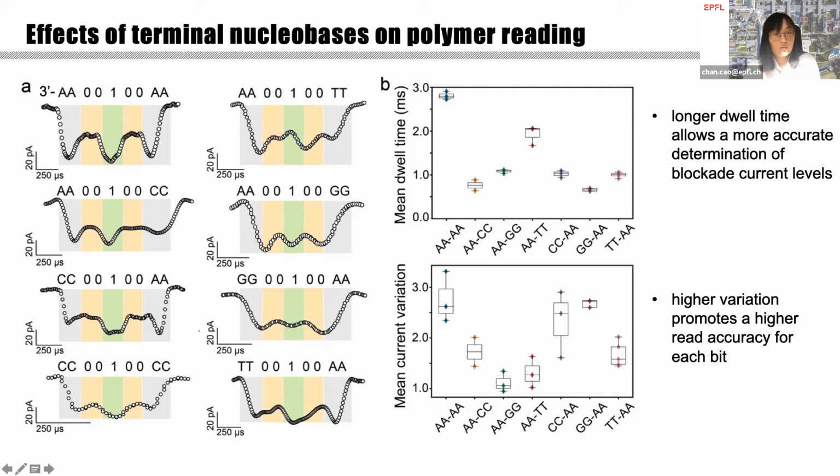So with this, we think this strategy not only can read bit 1 and 0 in the middle, it also can read the nucleotides at the terminals and also their order.